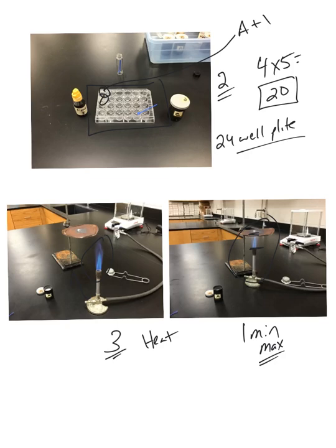So once you're done with that, turn the Bunsen burner off. Use your crucible tongs, which I did not include here. Do not use your beaker tongs, but use your crucible tongs to pinch the metal lid and empty it into the wastebasket. You might want to put it underneath your sink to cool it off and then wipe it off so there's no residue of that powder, and then add your next powder and heat it. You'll need to do that for each of the 5 powders.